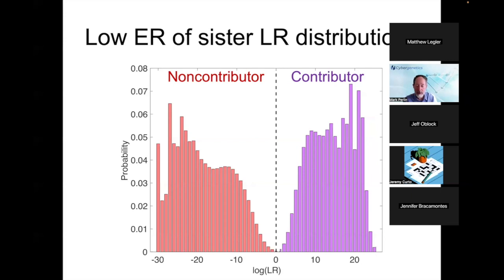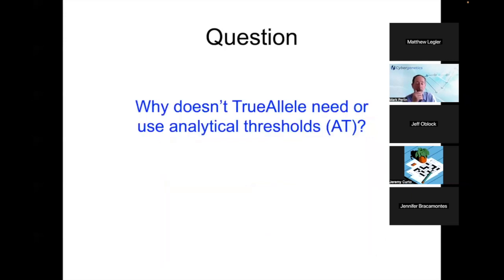You can validate from any genotype. You don't need anything special. And many of the labs have validated from casework. It's not clear that everybody understands this yet, but you do, or if you don't, you'll have questions that we'll answer. Okay, next, Matt.